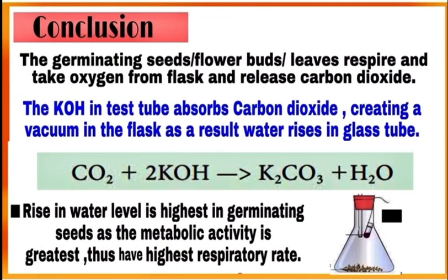Come to the conclusion part. The germinating seeds or flower buds or leaves respire and take oxygen from the flask and release carbon dioxide gas.